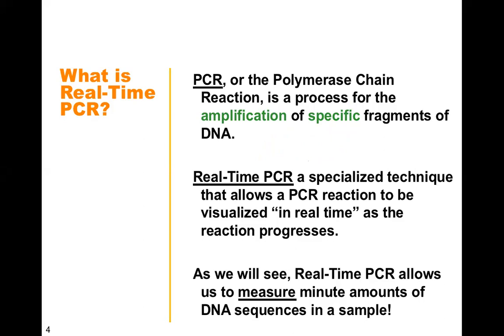Now the difference between PCR and real-time PCR is that in case of PCR, at the end, you get to see what the difference is, and in case of real-time PCR, you can see it in a real-time manner. Say, for an example, there are two people, one is thin and one is healthier. Just looking at them without having their weight, we can say that one is healthier than the other. That is PCR. But if you want to say it accurately, say one person is 50 kg and the other is 75 kg. Then we can say that the other person is 1.5 times healthier than the first person. That is real-time PCR.